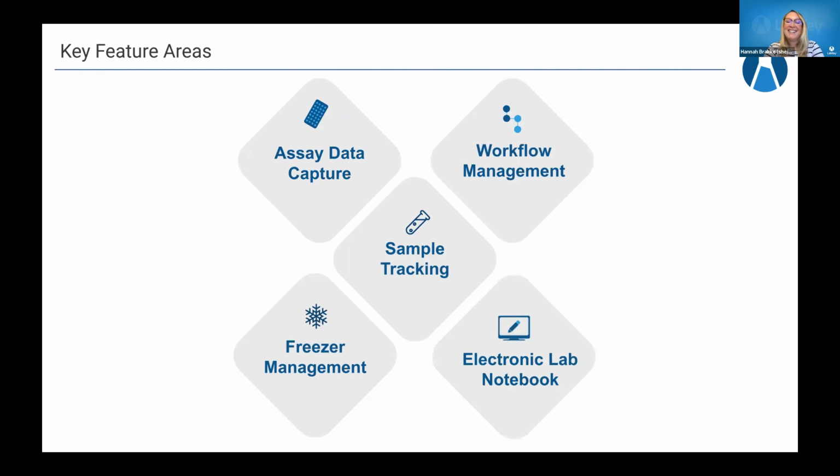And then our data connected electronic lab notebook, which really helps ensure that all of the data is being captured in a single system, and the data from these other four components are able to feed into that electronic lab notebook for that full chain of custody audit trail.